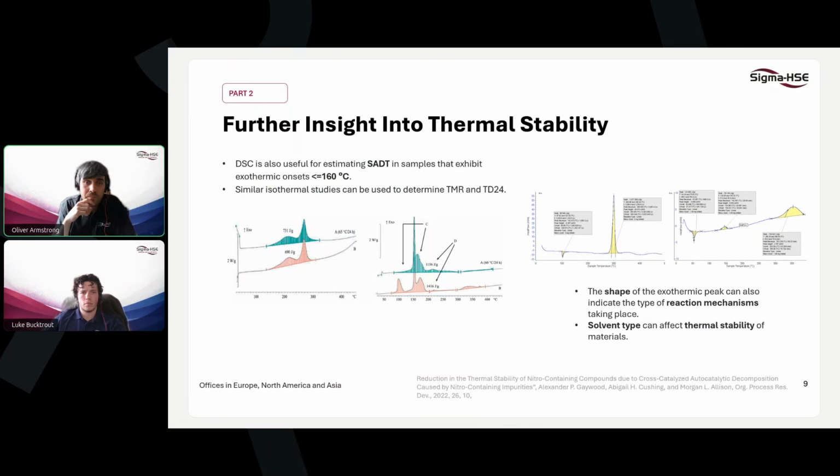Additionally, active compounds that exhibit exothermic behavior can be substantially affected by the choice of solvents in which they're dissolved. So it's commonly considered that inert solvents, not themselves having a potential for decomposition, will have little effect on the thermal stability characteristics of the mixture, but onset temperature of decompositions and their exothermic enthalpies have been evidenced to be affected significantly by the choice of different solvents.